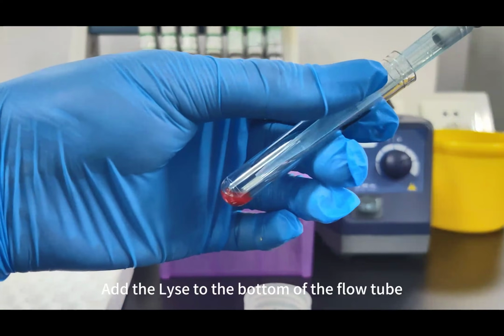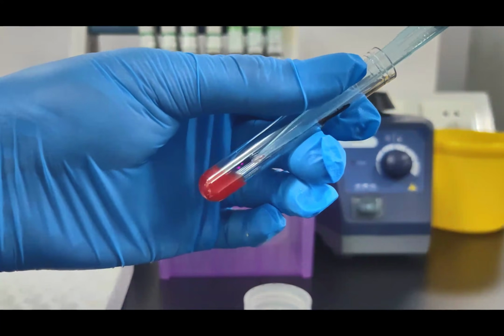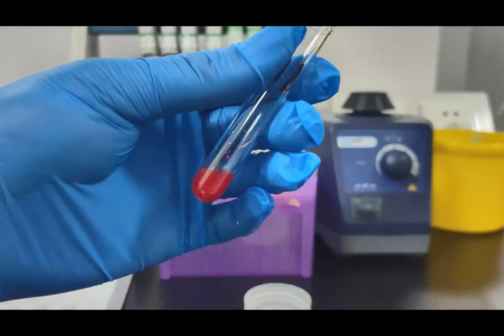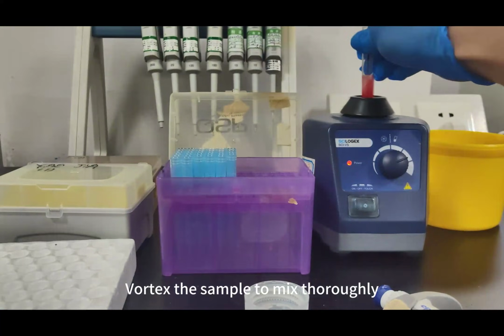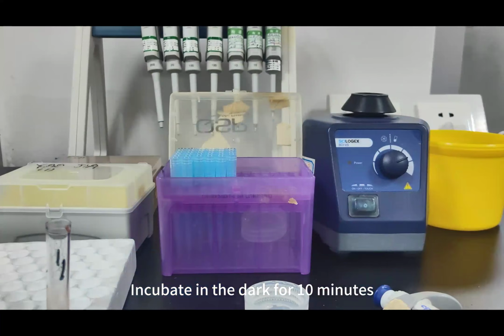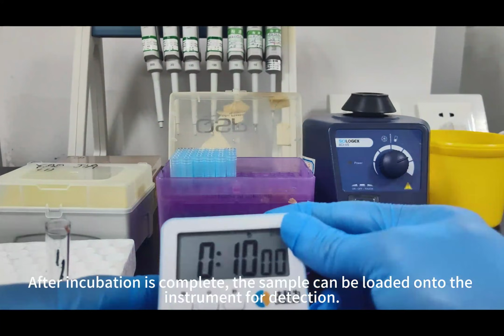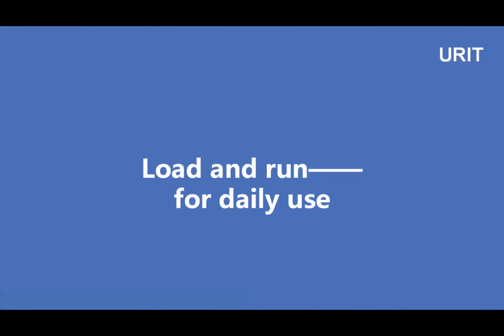Add the lyse to the bottom of the flow tube. Vortex the sample to mix thoroughly. Incubate in the dark for 10 minutes. After incubation is complete, the sample can be loaded onto the instrument for detection. Load and run.